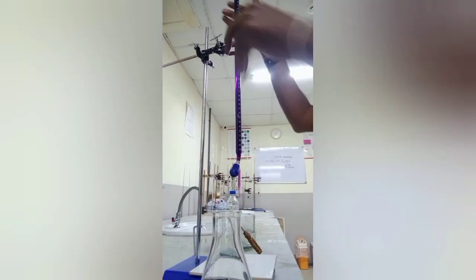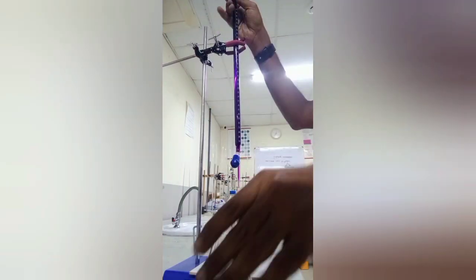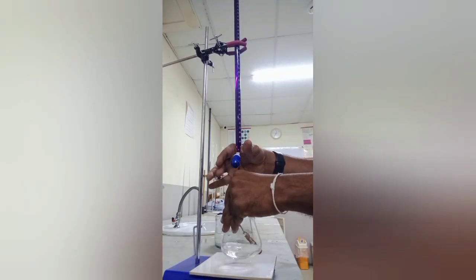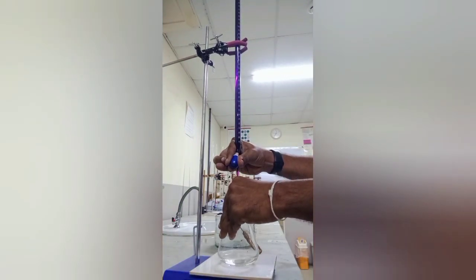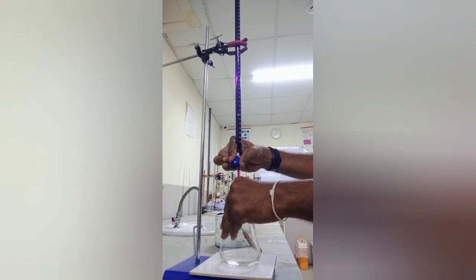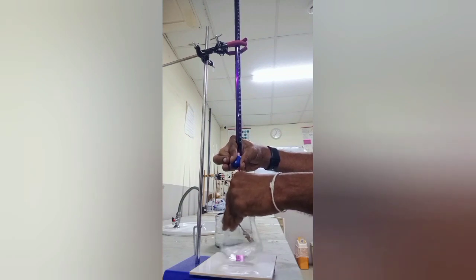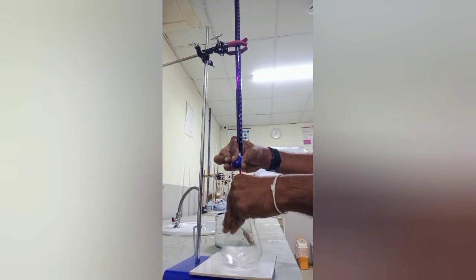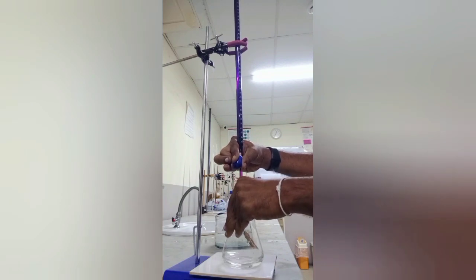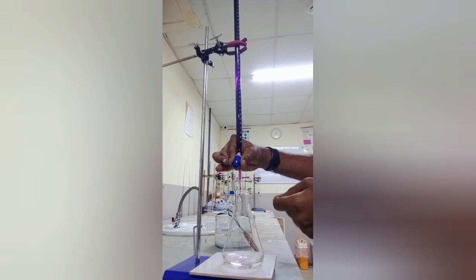Then you can start the titration. You can adjust the burette. First fix the knob, bring the knob under your control. Don't do it too slow and not too fast. It has to be moderate. The liquid has to be added dropwise. You are not supposed to do the titration like this. This is wrong. You can't catch the end point, you can't find the end point if you do it like this.